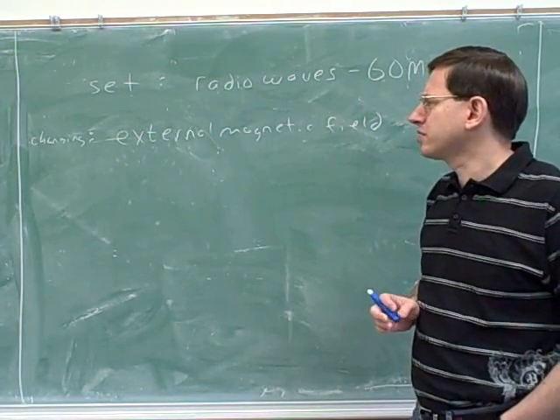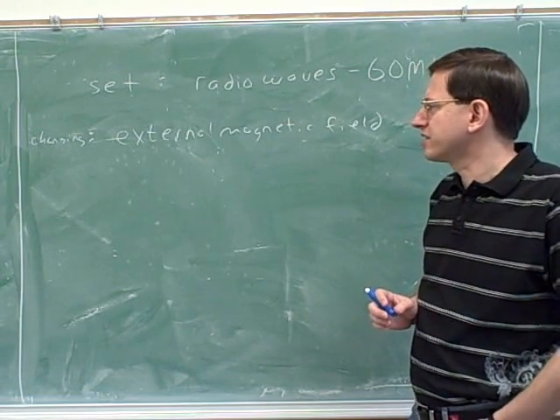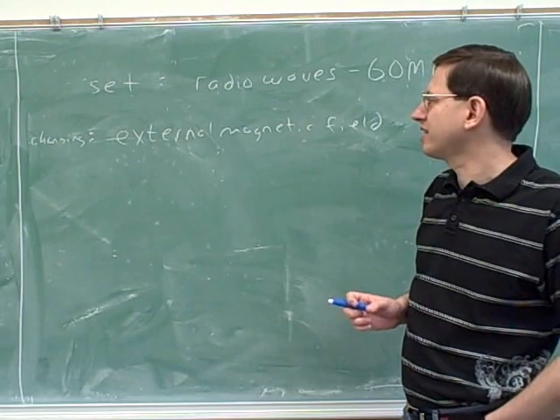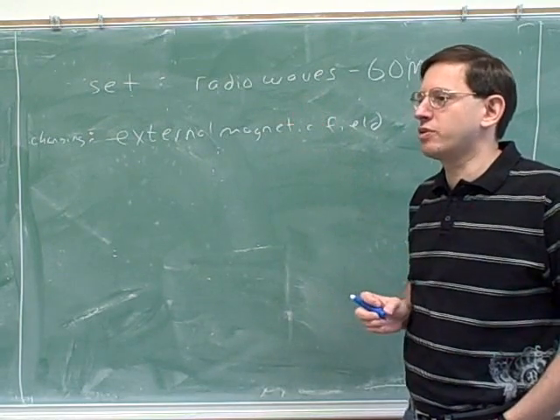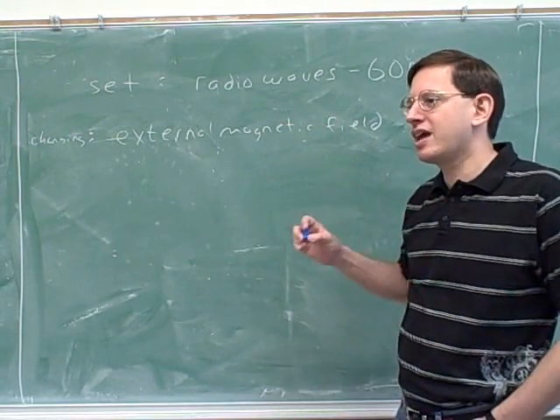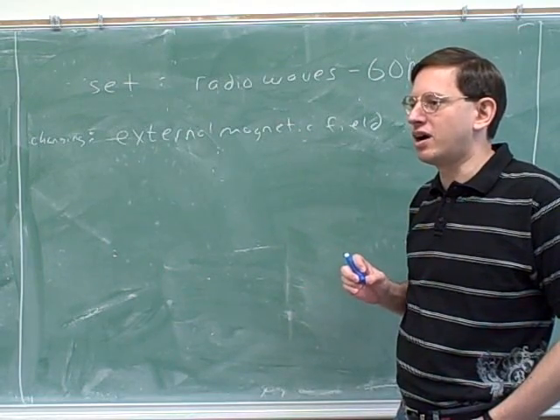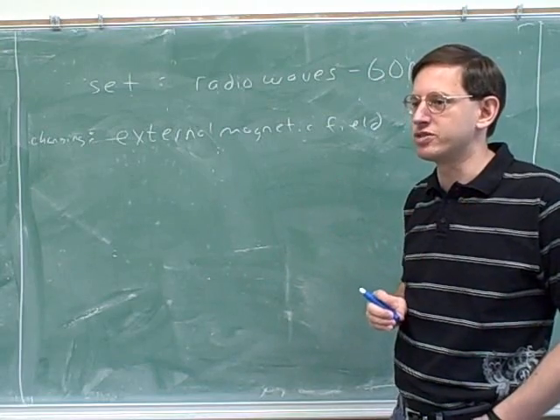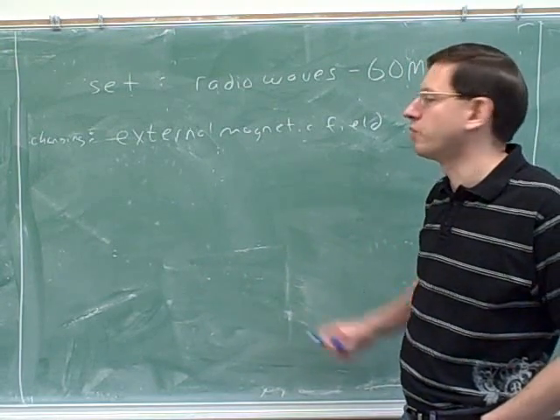Since we're just doing an introductory coverage today, and since our time is limited, we won't go into too much detail about the mechanics of this, because usually when you're solving problems, they're not asking you about the mechanics. They're just giving you NMR results and asking you to interpret them. So we want to spend almost all our time today on how to interpret the results. We'll just spend a minute or two more on where the results come from.